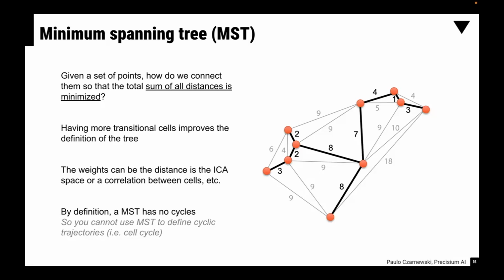For gene expression analysis, we had to use the normalized data, not the harmonized data, in order to avoid this integration and this variation reduction. But then here we try to find the minimal distance using data that has already been cleared of that variation, right? Correct. Yeah.